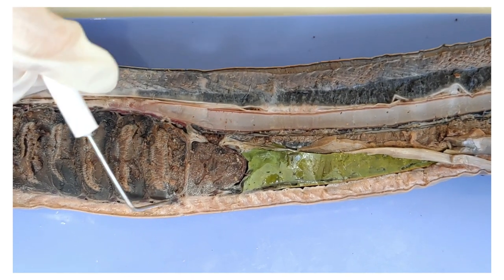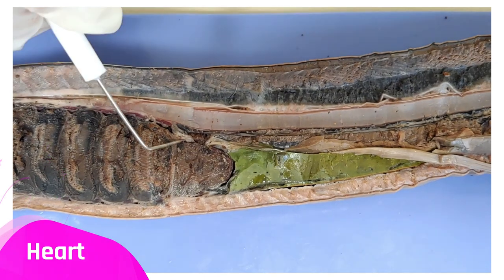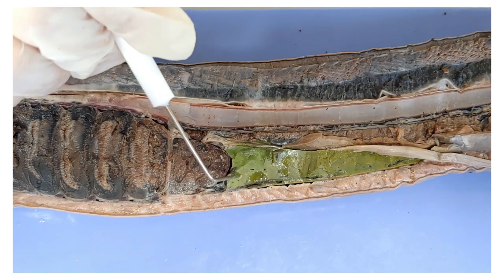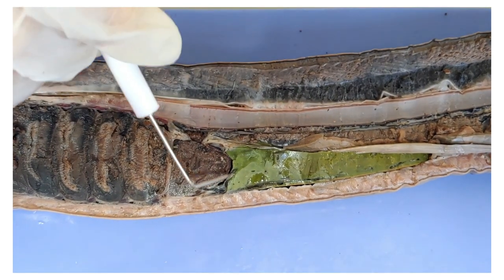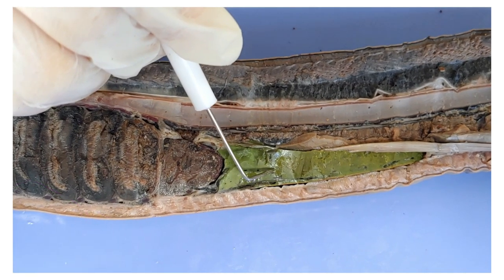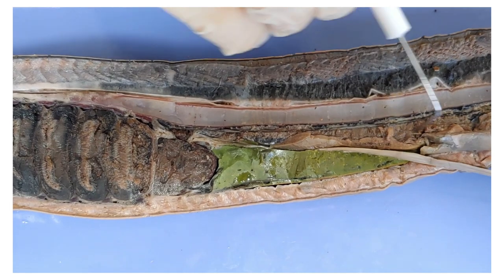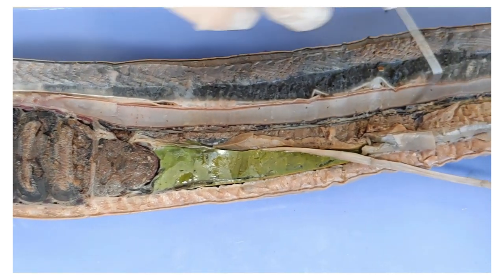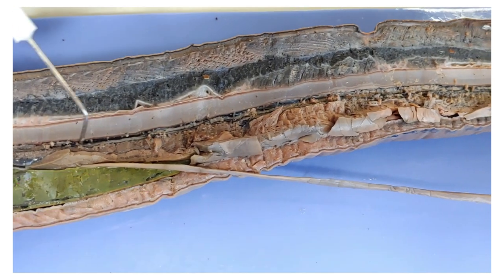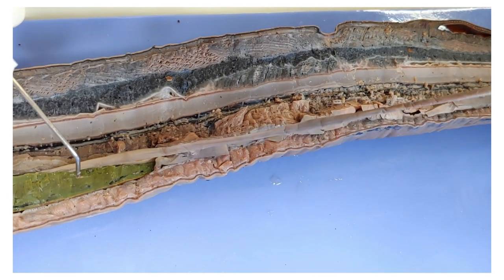Behind the gills you can see this structure, which is the heart — a muscular organ that pumps blood through the lamprey's body. Right behind that, you see this green triangle, which is the liver. The liver detoxifies blood and produces bile. And next to that, you see this structure that runs all the way down — this is the gonads, or the reproductive organs. You can see that the intestine runs between the liver and the gonads.